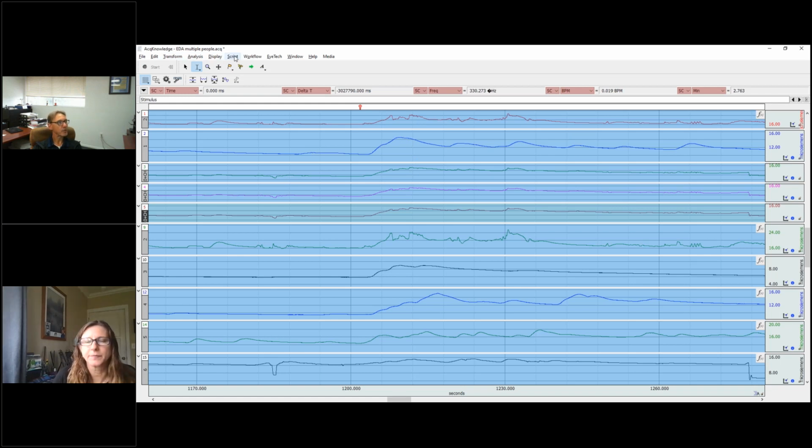So if you've got scripting, you've got this menu here. If you upgrade to 5.08, you will then have this menu appear here, the workflow menu. So if you have scripting, you will get workflow in essence for free with 5.0.8. And in a lot of instances, it's a free upgrade to 5.08, or it's a nominal price to upgrade to 5.08.